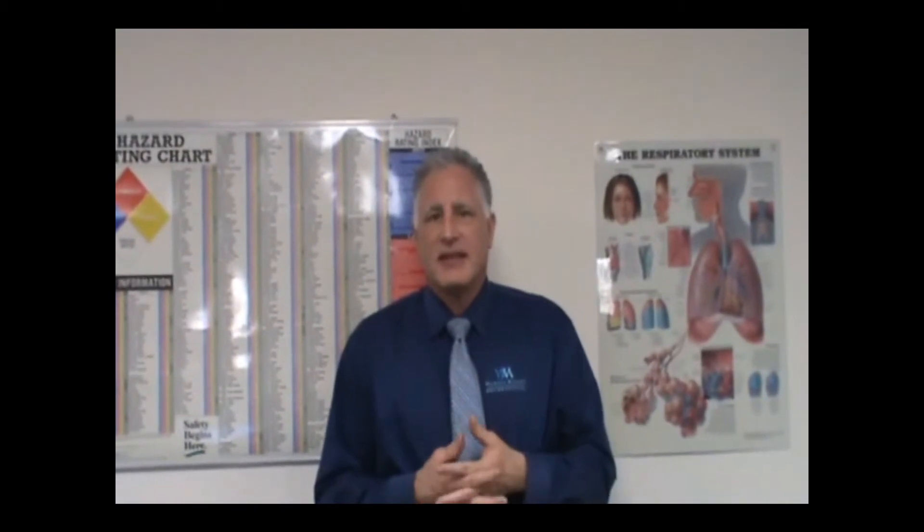Hello. What you're about to see is a demonstration video of the Asbestos Core Sampling System. Before you watch it, we just want you to realize that all of the materials we're sampling in this particular case are non-asbestos materials, so there's no danger to the individuals doing the work. However, if you're using the Wondermaker's Core Sampling System, we have had negative exposure assessment sampling done that shows you do not need personal protective equipment if you're taking asbestos samples with the Core Sampling System — it's that safe. Enjoy.